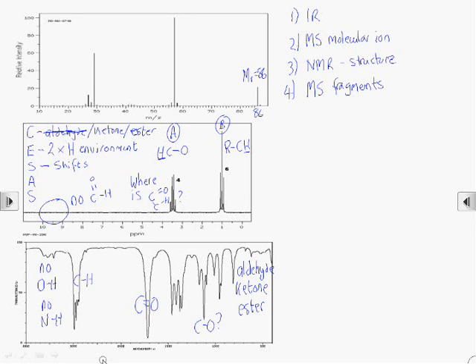We'd expect that kind of hydrogen to show up between 2 to 3 ppm. Looking then at the areas, we've got an area of 6 for protons in the B environment, and that's characteristic of 2 identical methyl groups.